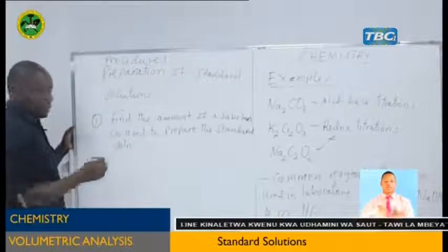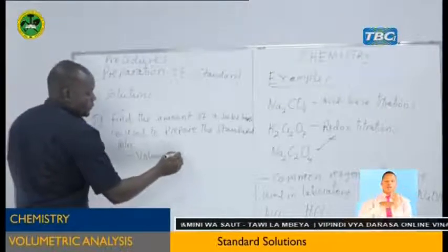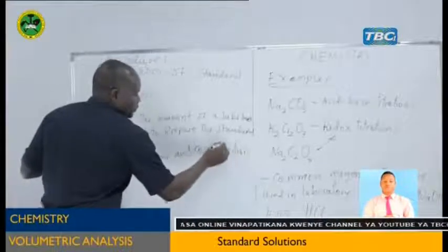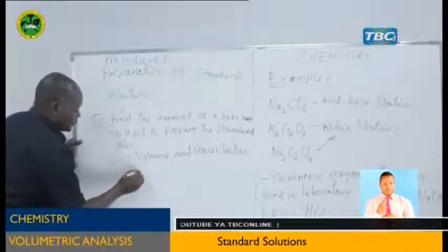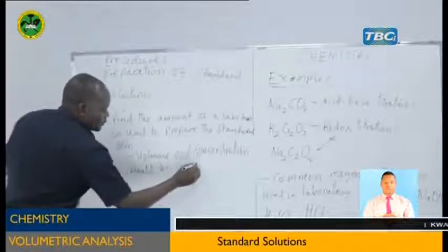And here the volume and the concentration of that reagent must be considered.